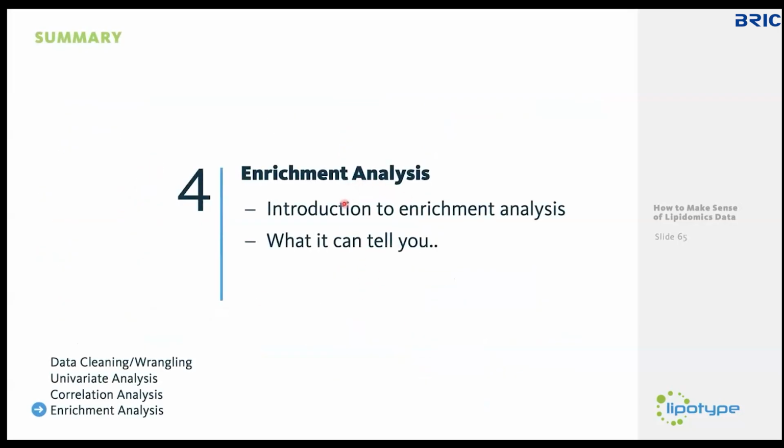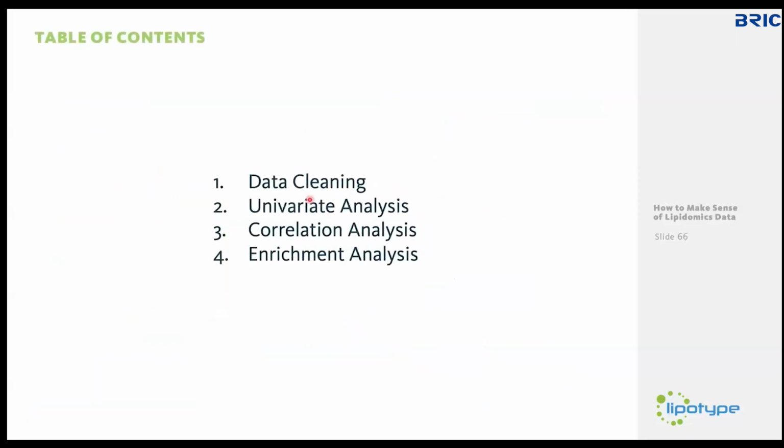Good. So what I told you is basically what enrichment analysis is and what it can tell you. Overall, I told you about data cleaning, univariate analysis, t-tests, correlation analysis, and how you can use a different numeric value you bring from outside the lipidome to correlate with your lipids. And afterwards, how to use these univariate analyses, correlation and statistical tests, both of which are univariate analyses, in enrichment analysis to find more general information in your data.